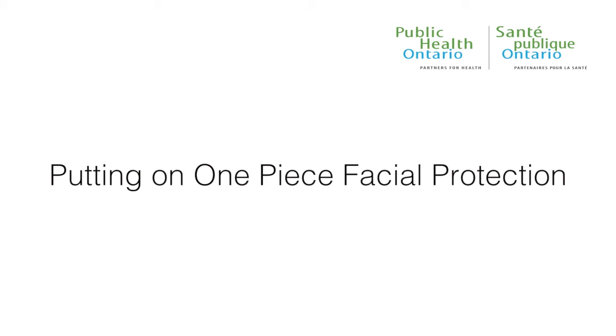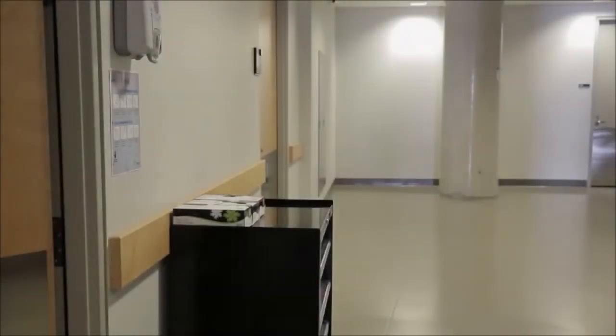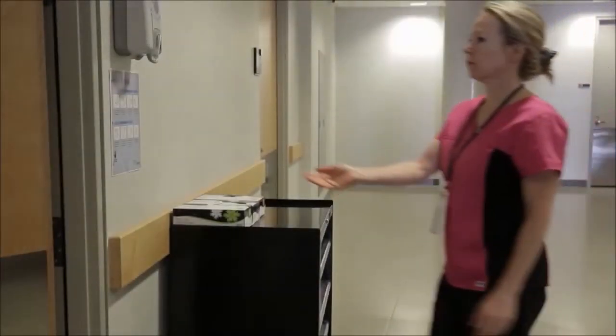Putting on One Piece Facial Protection. Clean your hands for 15 seconds before putting on mask and eye protection.